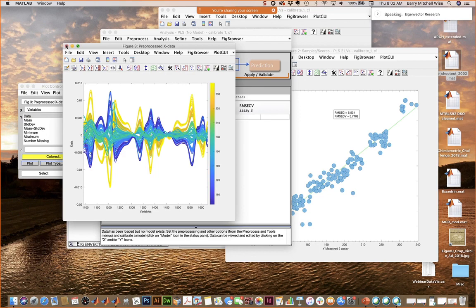Hey Barry, we had a question. What if you had a multi-Y calibration?